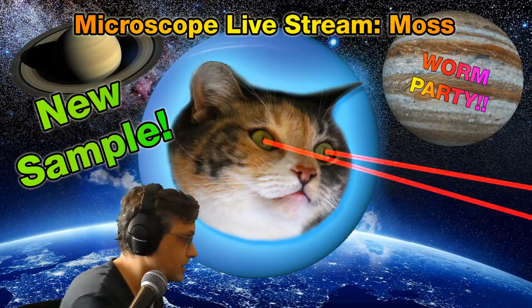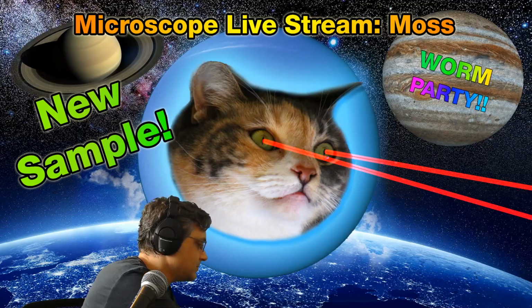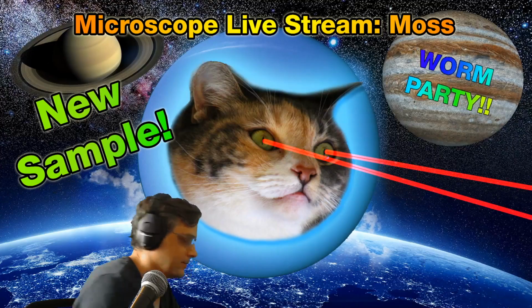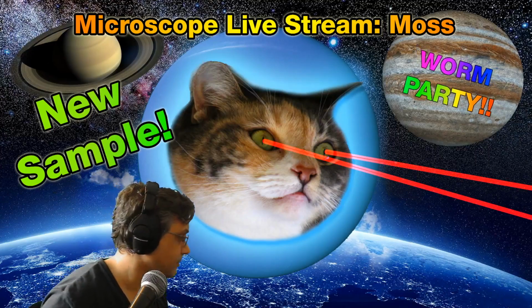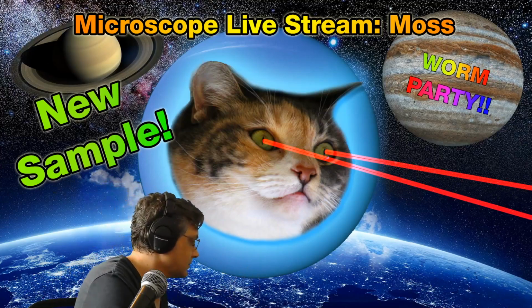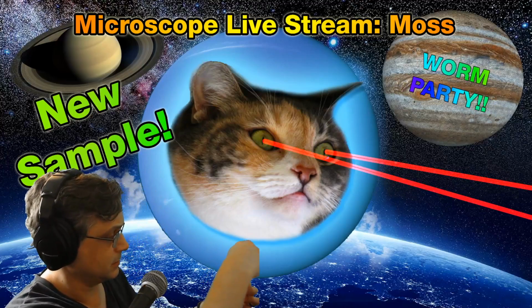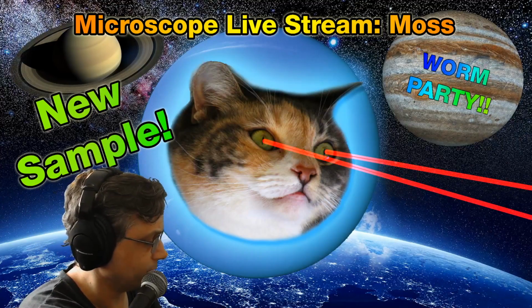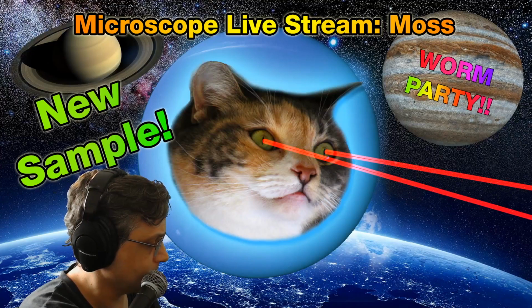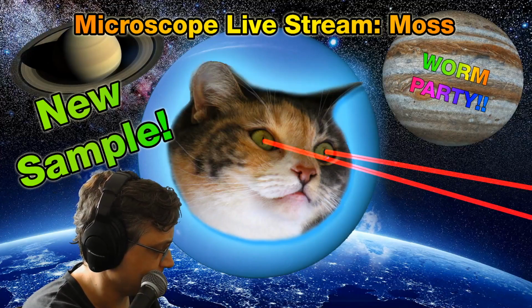I'm gonna do another drop here. Same sample, same slide. Let's see. Here we go. Just gonna try to get directly from the moss here. And I'd like to get some of the moss itself if possible.